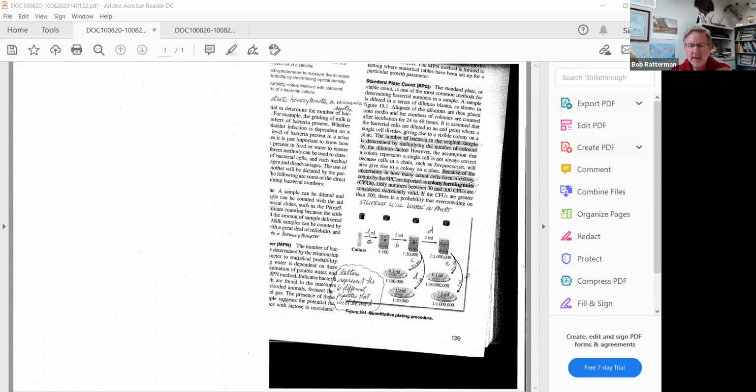So 1 mil added to 99 is 100. 1/100th of it is E. coli broth. Okay, so that's what the 1 in 100 refers to, the dilution that's created. That bottle was then mixed.